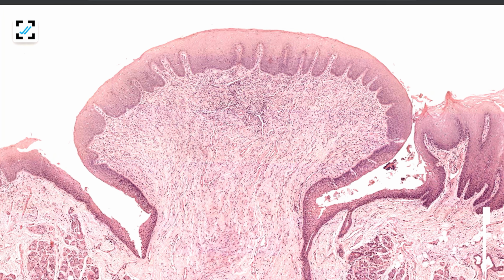Each papilla contains about 250 taste buds, and each taste bud is a barrel-shaped body which extends through the thickness of the epithelium and is made up of three types of cells: neuroepithelial, supporting, and basal cells. This is regarding the structure of circumvallate papillae.